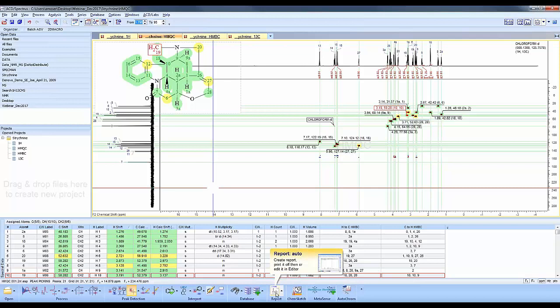Why did we do this? This is the fastest way to process your data, to go through four experiments. If you have more experiments, you can also include those and create a report.